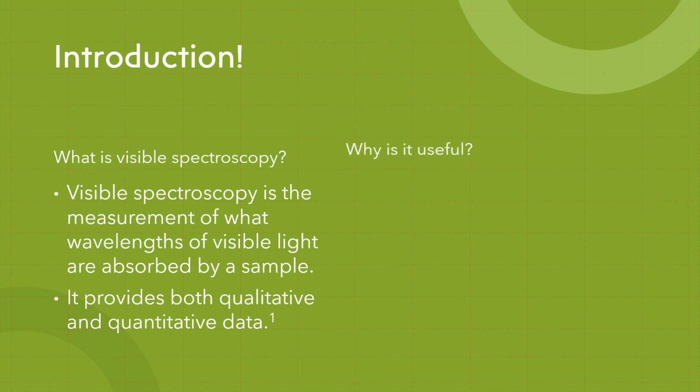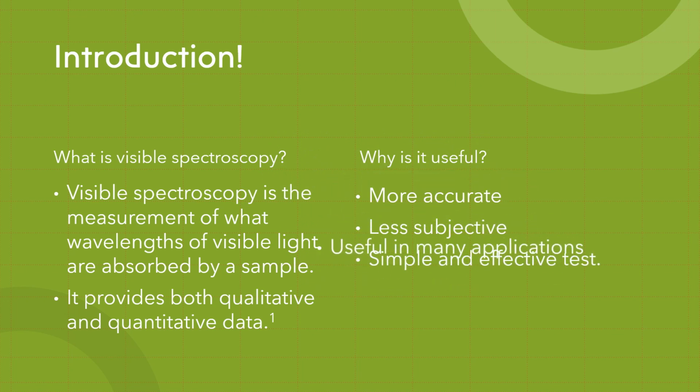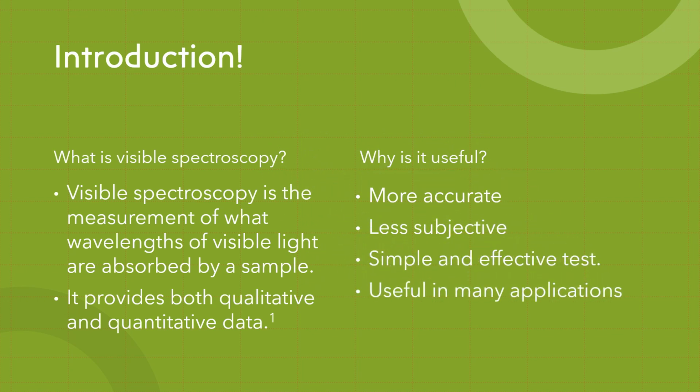Why is spectroscopy useful? Well, it's more accurate than human eyes, it's less subjective than human eyes, and it's simple and effective. Useful in many applications such as testing concentrations or finding the exact colour, as you'll see in the next slide.